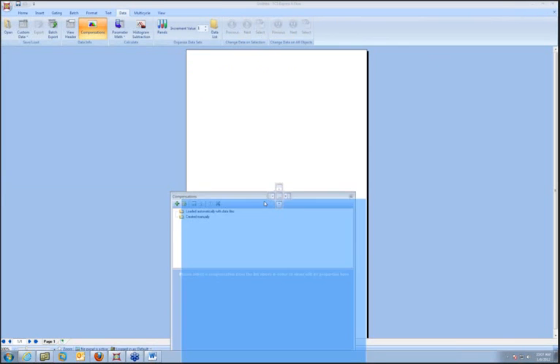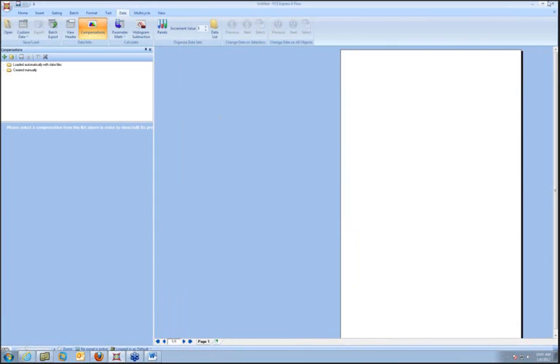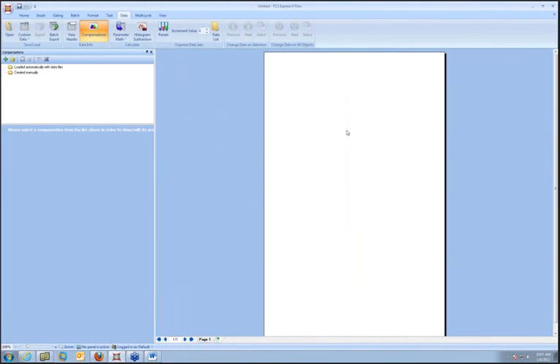And you can dock it to the side like you can with everything else. And that's a standard docking feature. We do have a webinar about docking and how to dock multiple things open. The cool thing about the docking is now you can keep your compensation settings open at all times.